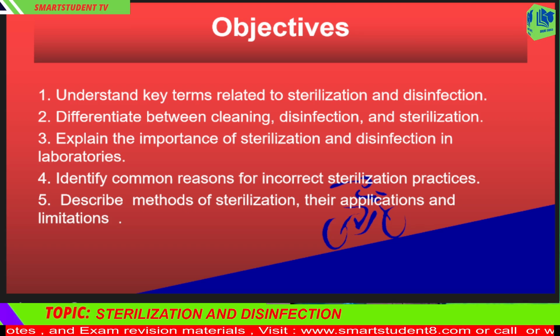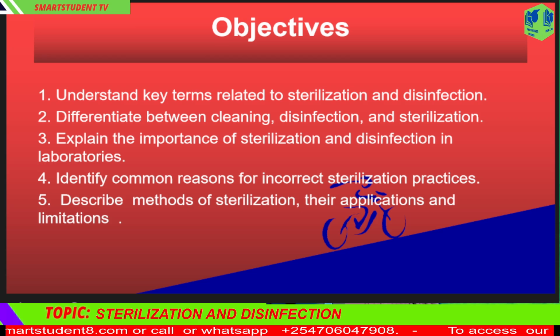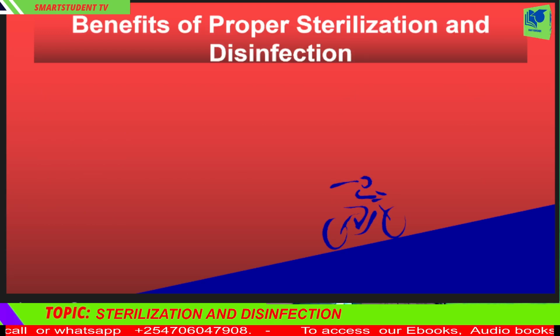Importance and significance of sterilization and disinfection. Why do we care so much about sterilization and disinfection? Let me paint a picture. Imagine a microbiologist working with dangerous bacteria. Without sterilization, any leftover bacteria could spread, causing infections or even outbreaks. Benefits of proper sterilization and disinfection.